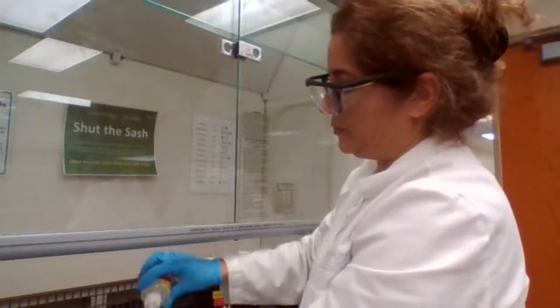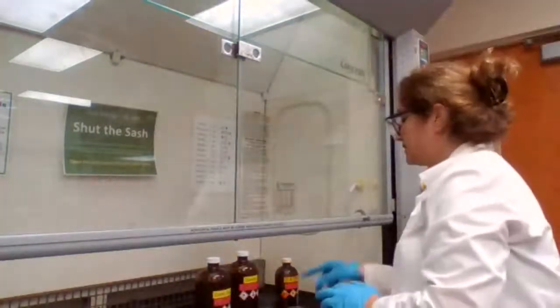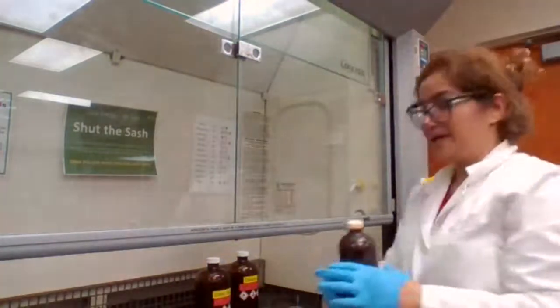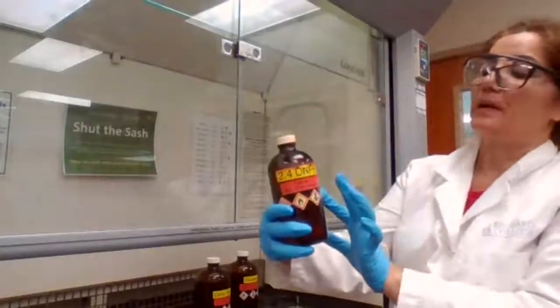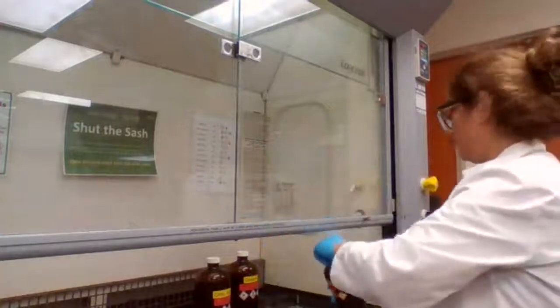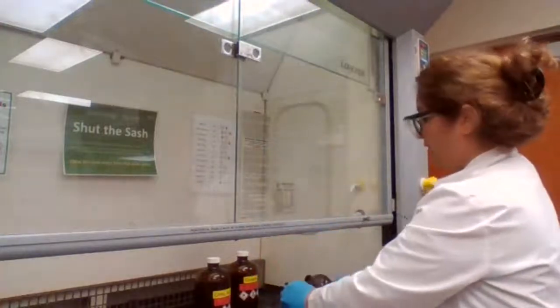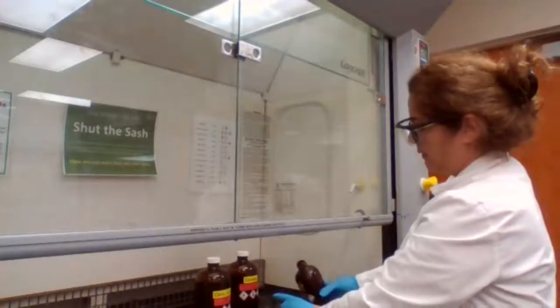Now we should be able to eliminate one of these unknowns at this step as water, because if it doesn't react with the reagent, 2,4-dinitrophenylhydrazine, it is going to be water. If it's an aldehyde or ketone, it will react with the reagent.